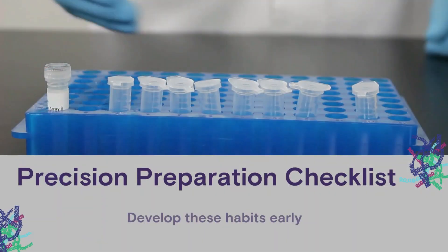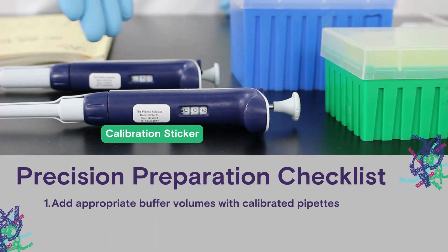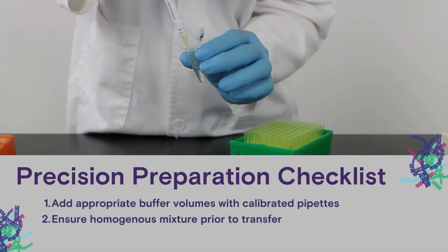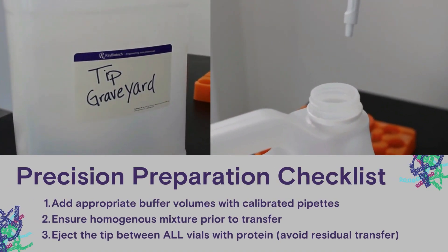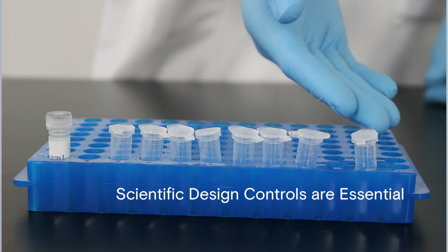So here is your precision prep checklist — a series of habits that you should develop with all of your standard curves. First, the appropriate buffer volume should be added with calibrated pipettes. Second, you should ensure a homogeneous mixture of each solution prior to transfer. Third, the tip should be ejected between all protein vials to avoid residual transfer. You should discard the tip each time to ensure there is no residual concentration from the pipette tip influencing your readings. Ensure not to carry any protein into the blank — we want this blank to remain without protein so we can have a measure of zero without protein.